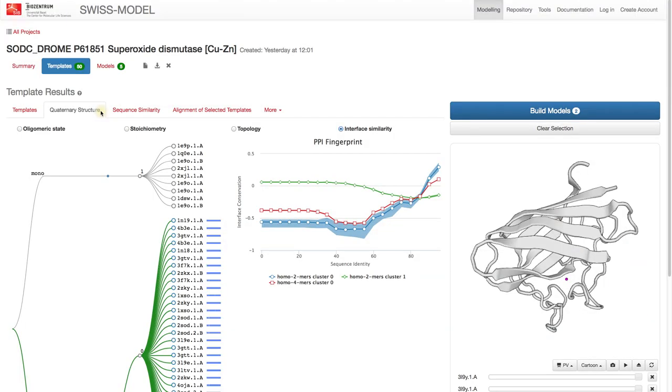The Quaternary Structure tab shows the templates represented in a tree, which clusters the templates at different levels.